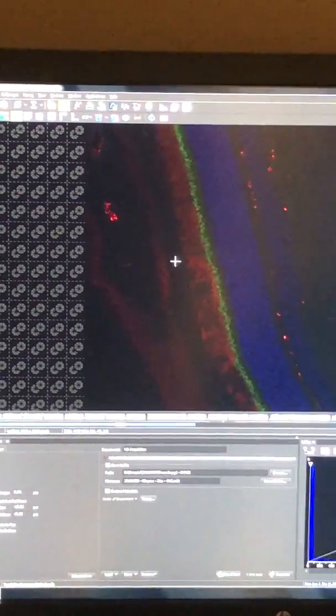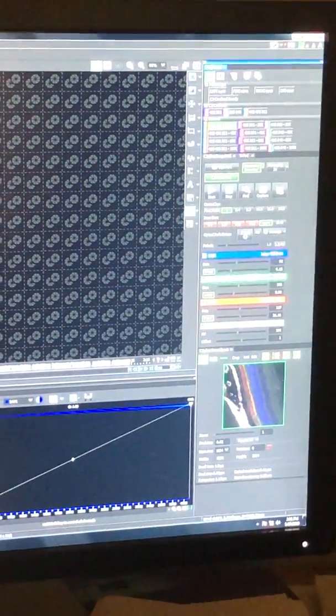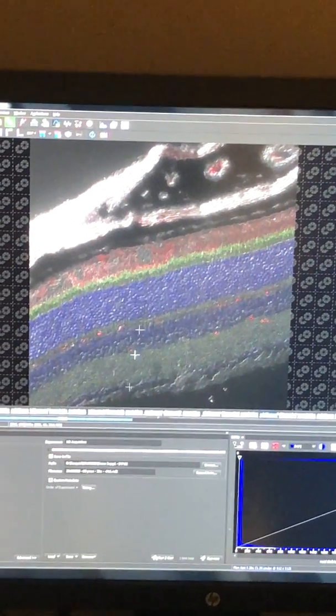Something that I did not teach you is how to make a rotation, a good plane there. If you want to rotate this image, you can go to Image, Rotate. Let's rotate to the right, all frames. We're going to keep with this. Then I'm going to show you how to do it in a different way.